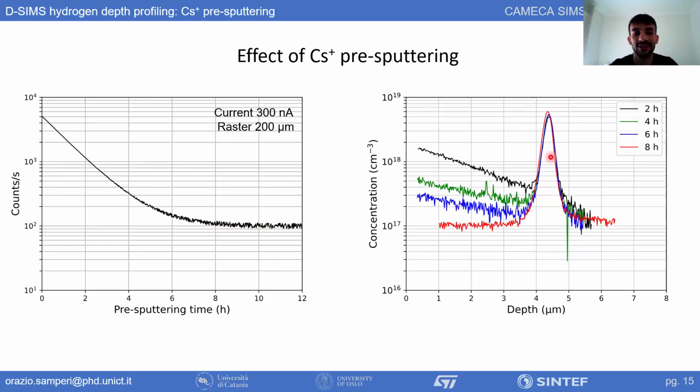And these are the results if you take the measurement at different times after the irradiation. The first measurement, for example, after just 2 hours of irradiation, is not a good measurement because you have quite a high background and the baseline is not straight. If you want to take something from this measurement, you have to subtract the baseline and so on.